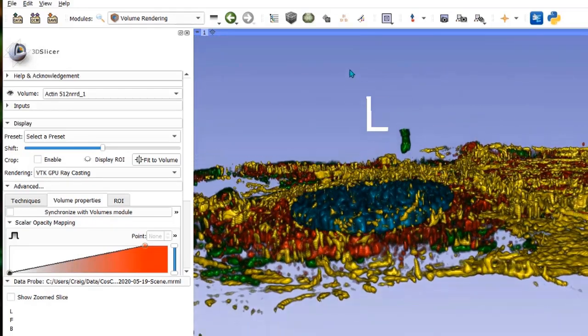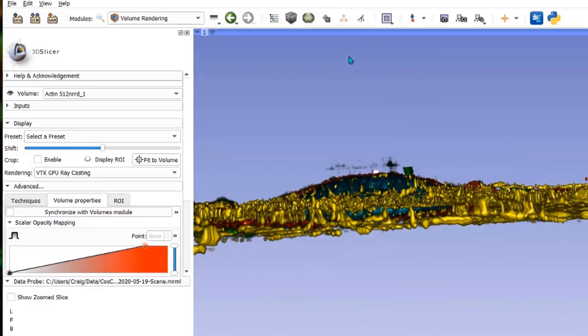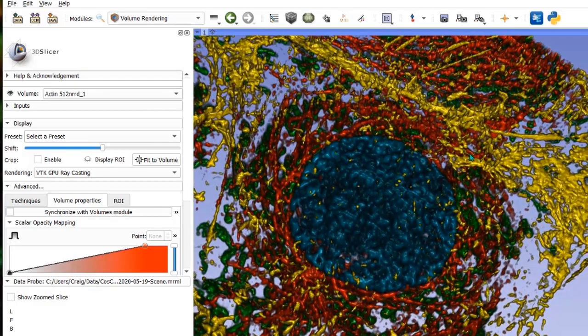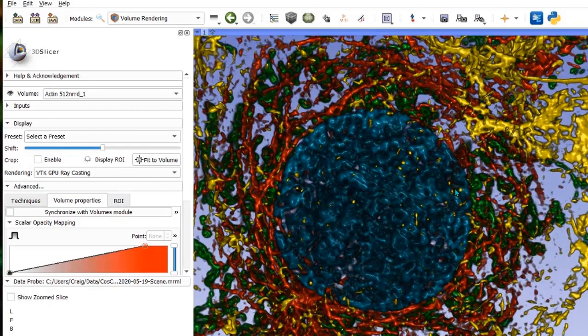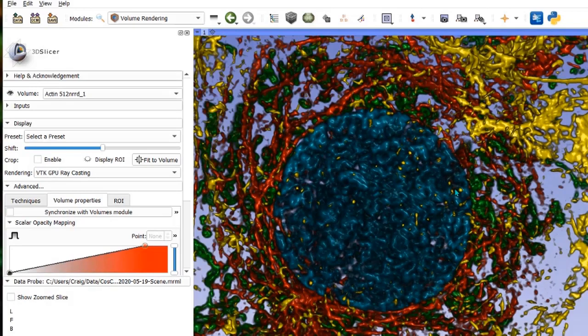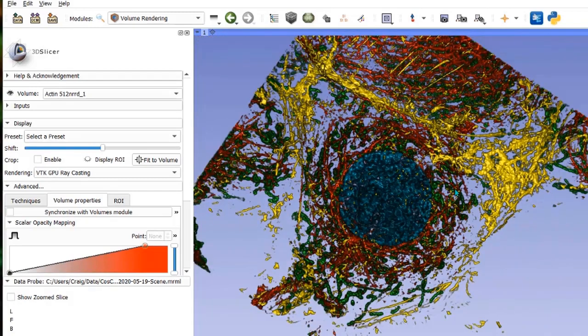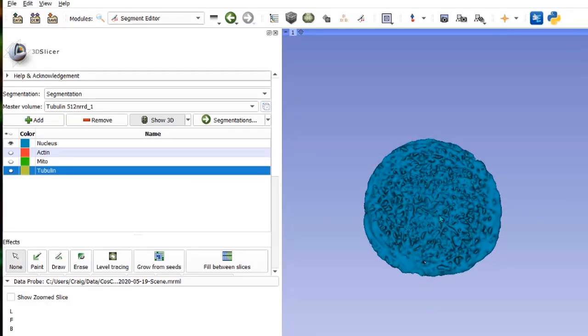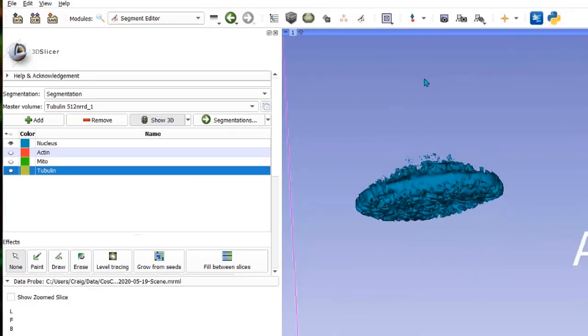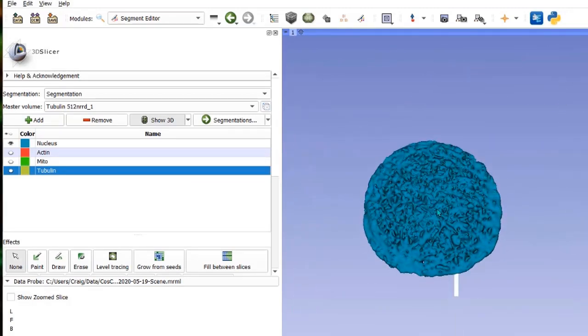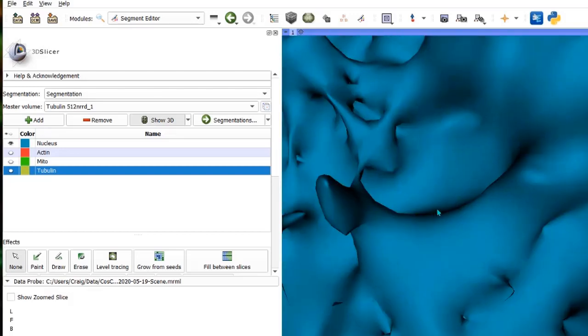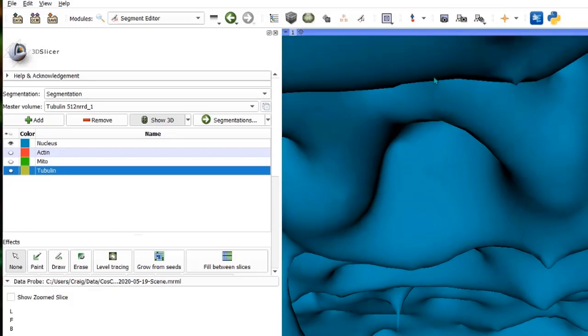However, to get the data into a format that can be used by animation and VR applications, we need to threshold and segment the data. 3D Slicer offers a variety of methods for data segmentation. Here's the segmented cell nucleus. It's basically just an iso surface or a wireframe mesh that's been given a surface color. We can fly inside and see that it's a hollow object.